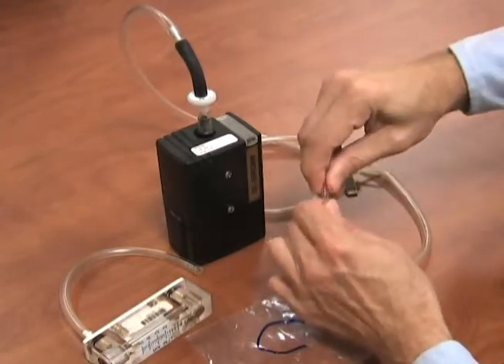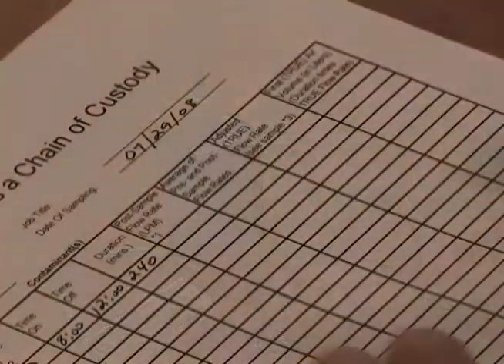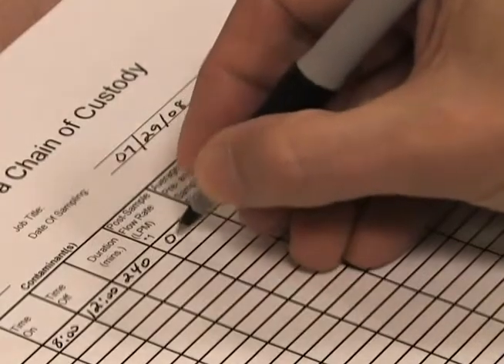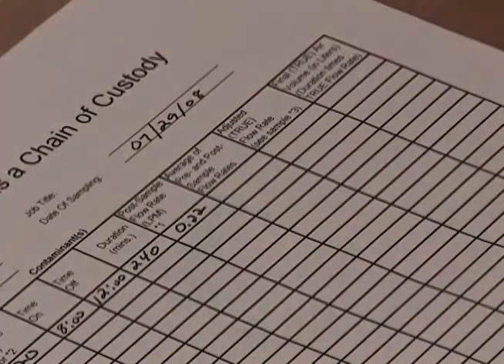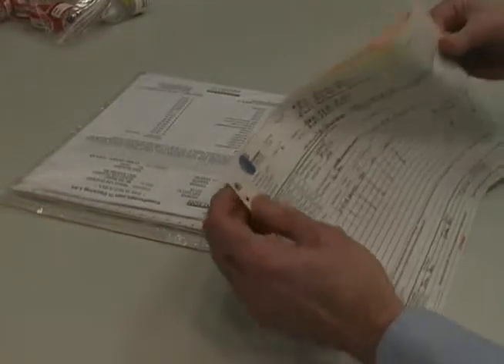Perform a post-calibration in the same manner you used to perform the pre-calibration, then record the flow rate on the pump calibration sheet. Then complete the chain of custody form. It is important that you include all the information requested in order to ensure the turnaround time of your samples.